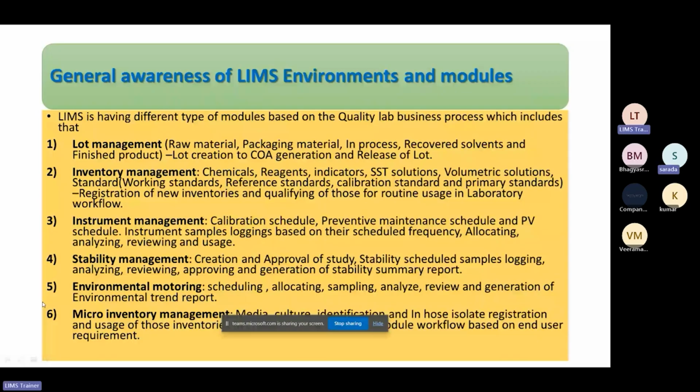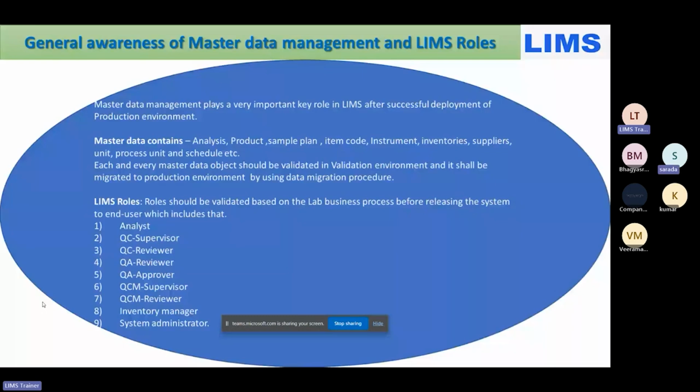Then, as I have explained, there are LIMS roles. Somebody will be end user analyst, somebody will be supervisor, reviewer, approver. Then these login credentials will be provided as per the requirement. And this is the administrative part, like who will be the system administrator, he will manage all these logins.